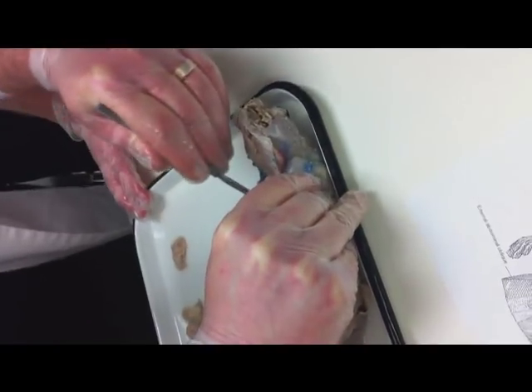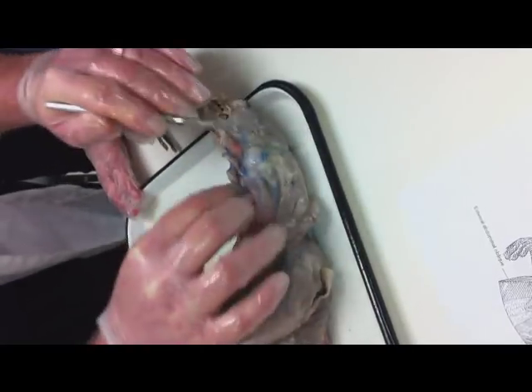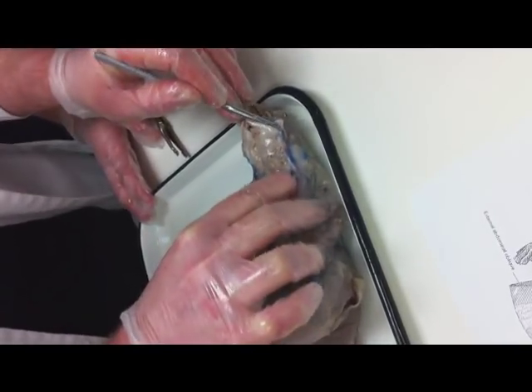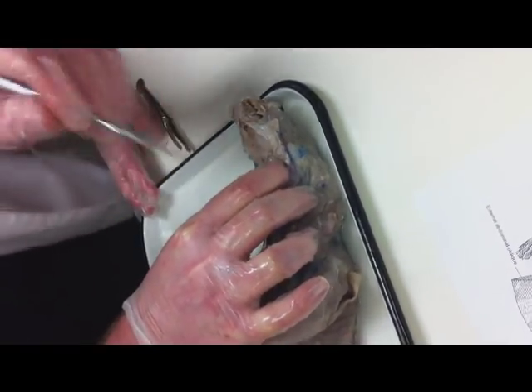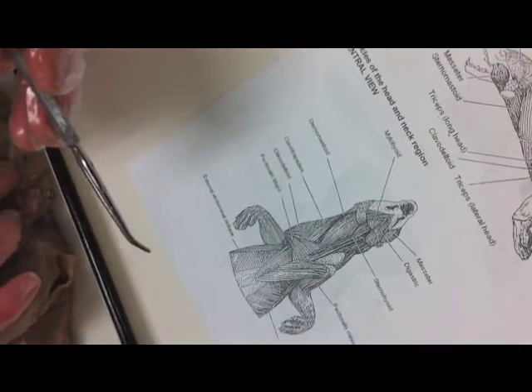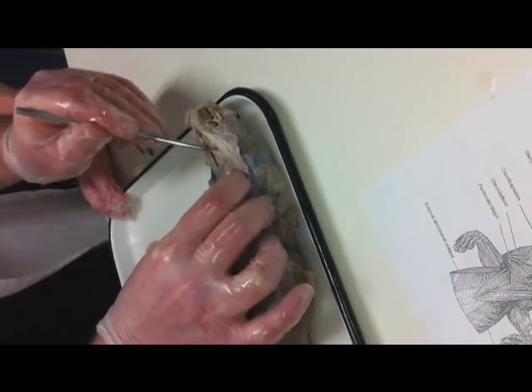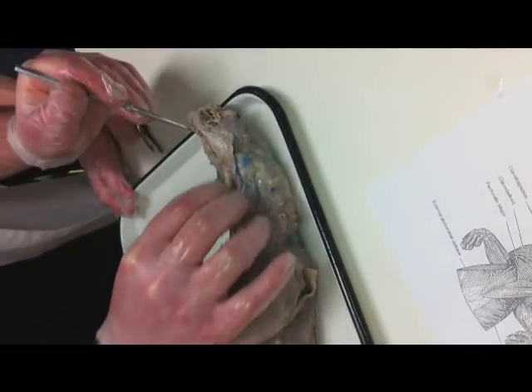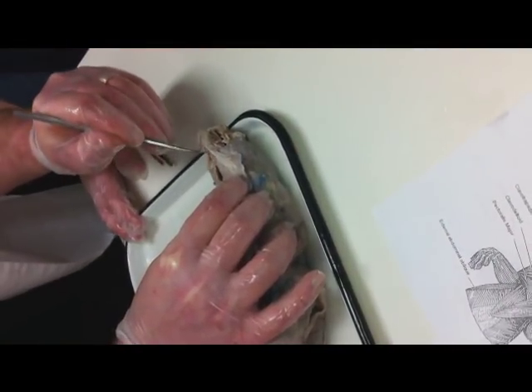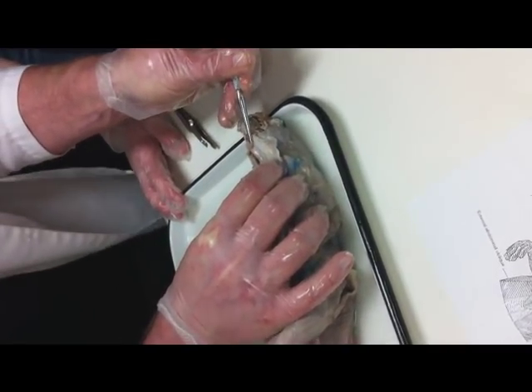And now I'm going to keep teasing that sternomastoid apart. And as I do, I begin to expose some of the muscles of the throat, up here. Here are the masseters. We already did those. There's two large muscles in here that cause his jaw to pull down. Those are his digastric muscles, and they are here and here, those great big ones there and there. Okay? Oh, up here, there's a little triangular one called the mylohyoid, which I may have mangled a bit. It's right there, that little triangular one, which I did mangle a bit.